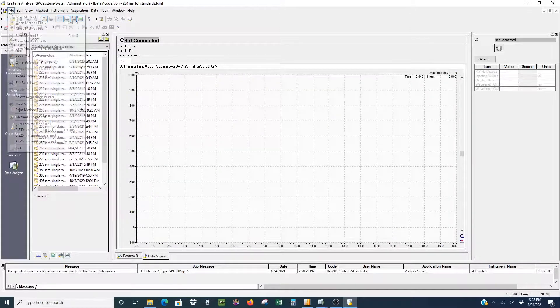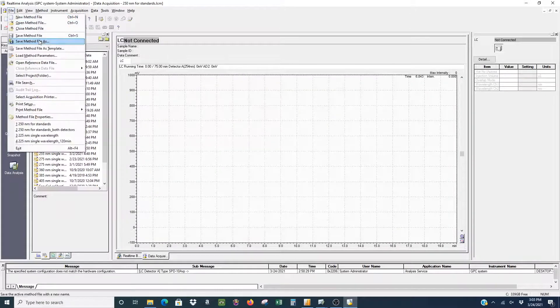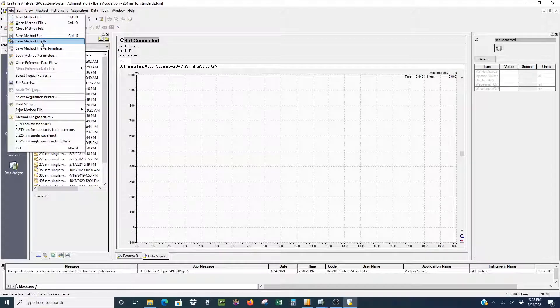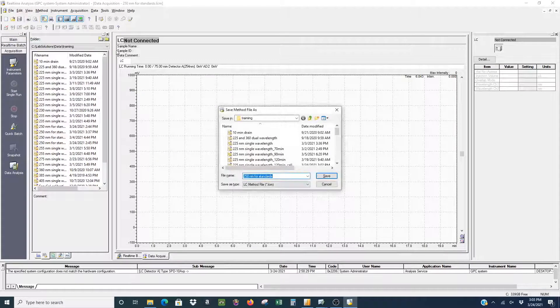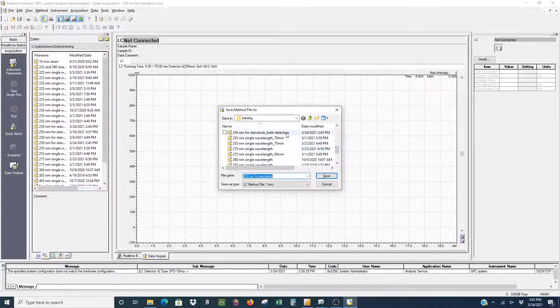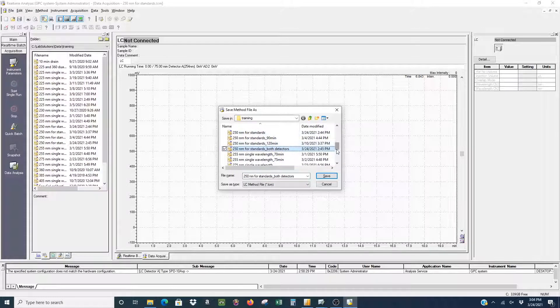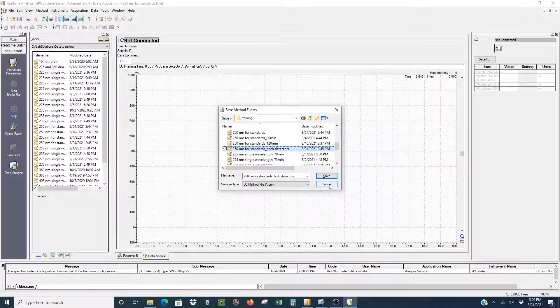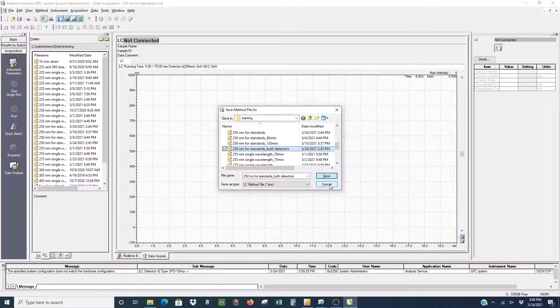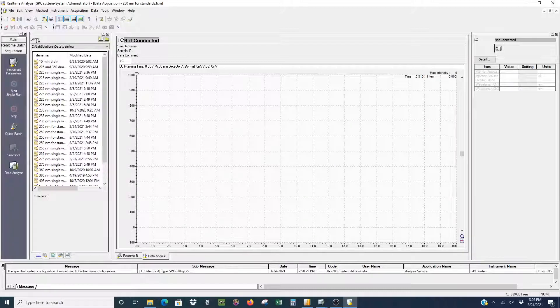Now that we've made that change in the method file, we have to save our method file. So if you made any changes, make sure you save as and denote what you've changed. In this case, the only thing we changed is that we selected both detectors and we already have that file made. So we're not going to save this file because we already have that one.